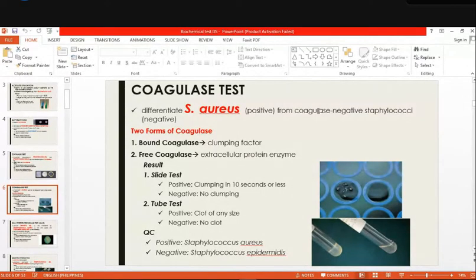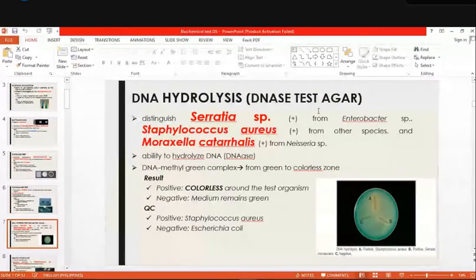Okay. Okay pa kayo? Ilang test pa lang yun. Isang katerba pa ang kasunod niya. Di ba? Sabi nyo nga, overwhelming. Sobra talaga. So we proceed to the other enzyme test, our DNA hydrolysis.